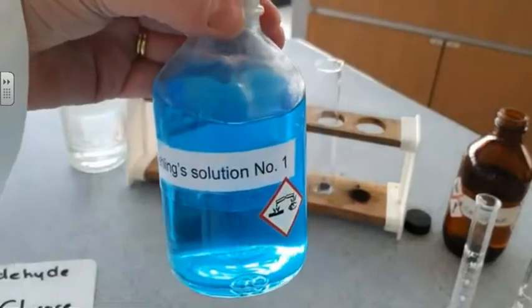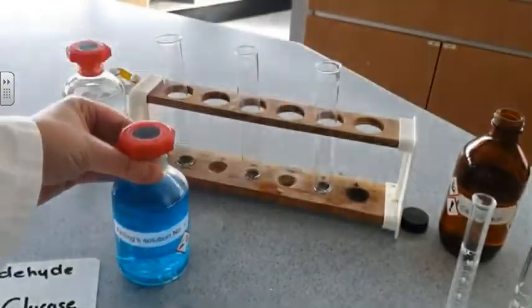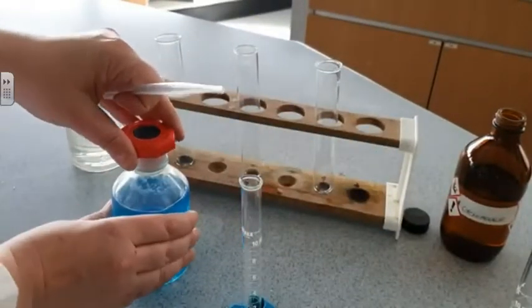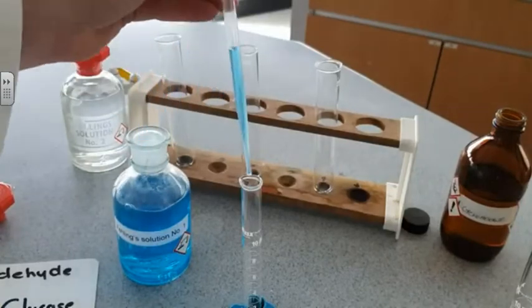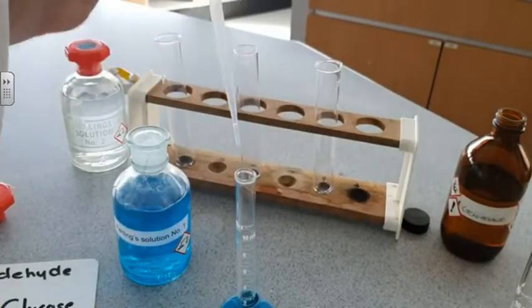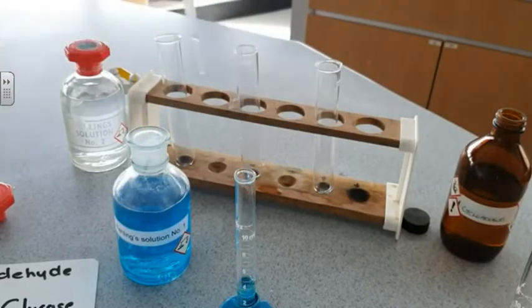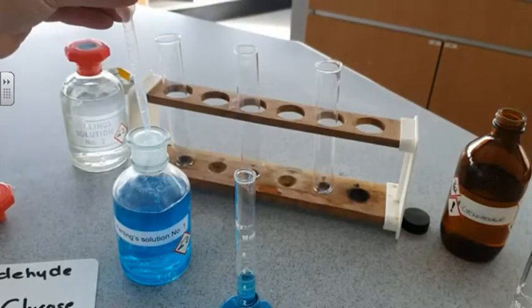And now we're going to test for an aldehyde. There are two different tests for an aldehyde. This one is testing with Fehling's solution. And to make Fehling's solution you need to mix the two parts. It's a two-part solution, so we've got Fehling's 1 and Fehling's 2. Just going to mix together. Fehling's solution contains copper 2+ ions. That gives it the blue colour, characteristic of compounds with copper 2.